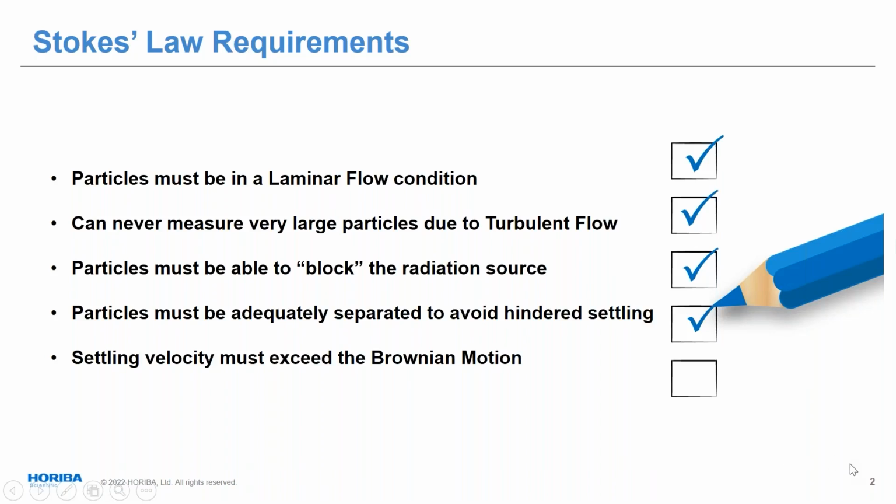What is happening is that as a particle sediments downward, it displaces liquid that used to occupy the space it's moving into. That liquid, as the particle pushes down, is going to go up around the side of the particle. If your particles get too close together, that upward-moving liquid is going to influence the neighboring particle, and it's going to end up rising when it should just be sitting there while the other particle sediments. So when particles, in this case, rise, that's going to end up looking to you like much smaller particles than they really are.